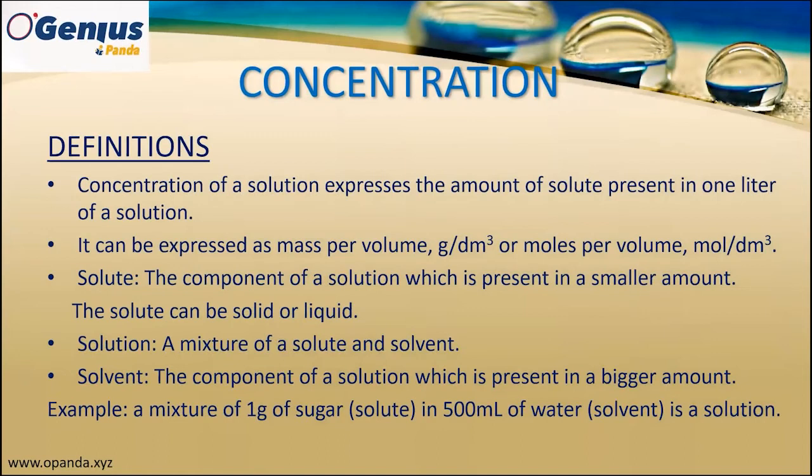Before we explain how the lab simulation works, let's have a look at the key definitions. What is concentration? We are going to discuss concentration, and use the lab simulation to show how we can prepare various solutions, of course, having various concentrations.